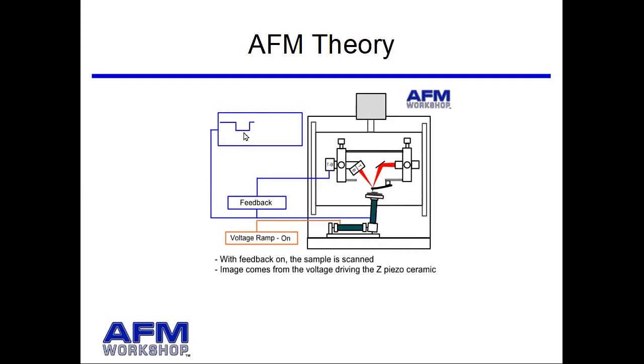In principle and in practice, learning how to run these microscopes is about as much effort as it takes to learn how to drive a car. And we'll talk about that later.